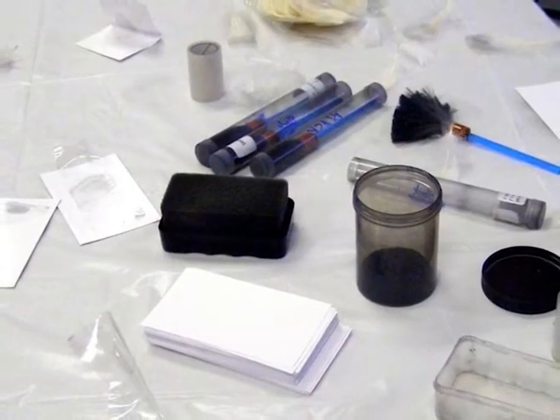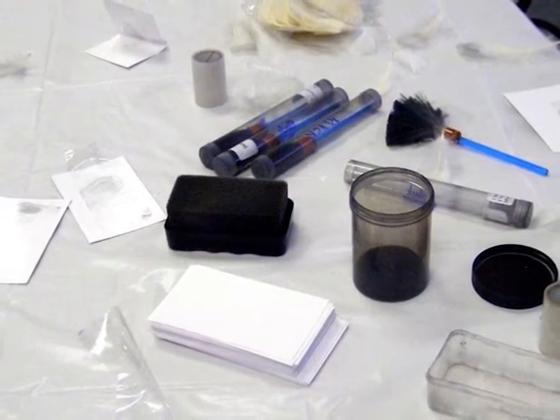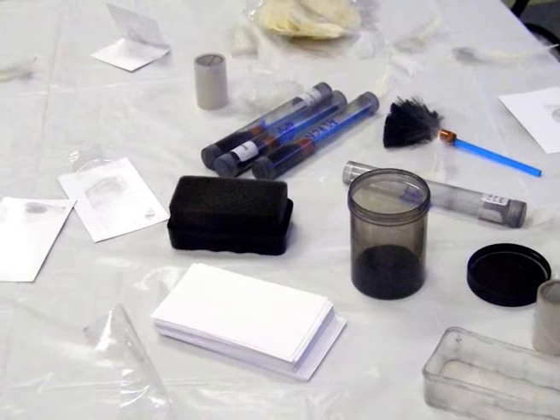Samples bearing latent fingerprints are dipped into the test solution for 15 seconds and then air dried. These are then heated in an oven to 110 to 120 degrees centigrade for 10 to 15 minutes. Clear and sharp fingerprints develop.